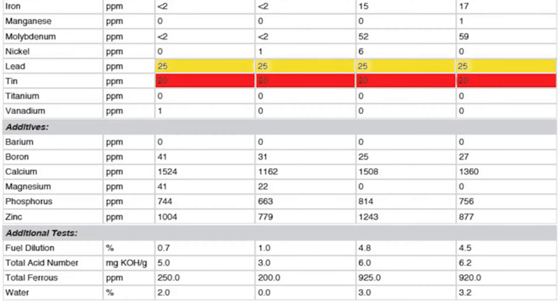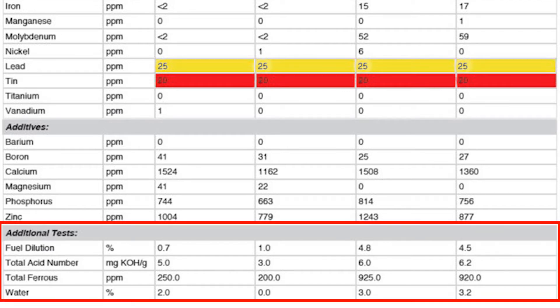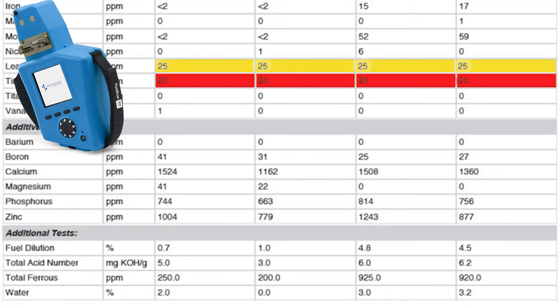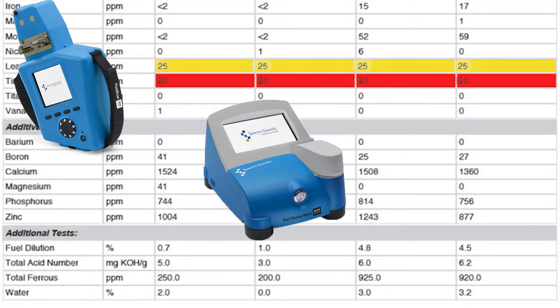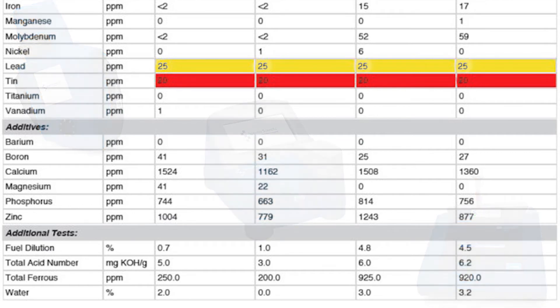The last section, for additional tests, are parameters run on other Spectro instruments, such as fluid scan, fuel dilution meter, and ferro check, to provide additional information about the oil condition.